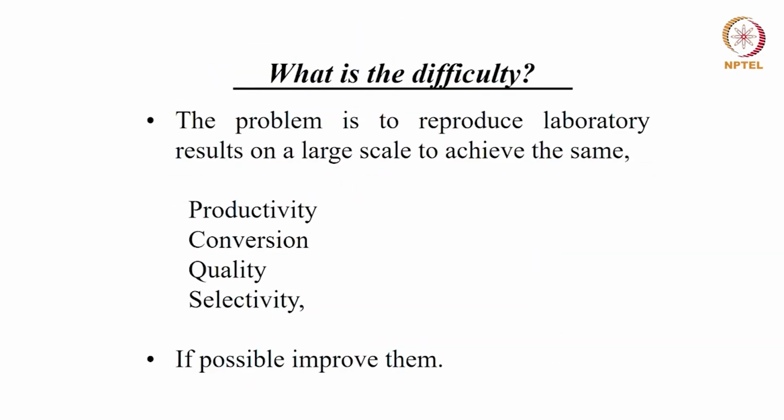But where lies the difficulty? The problem is to reproduce the laboratory's result on a large scale to achieve the same productivity, or same conversion of the substrate, or same product quality or the selectivity. And if possible, to improve it.